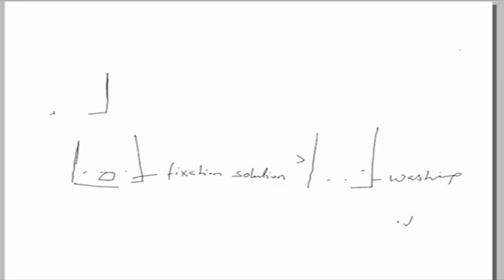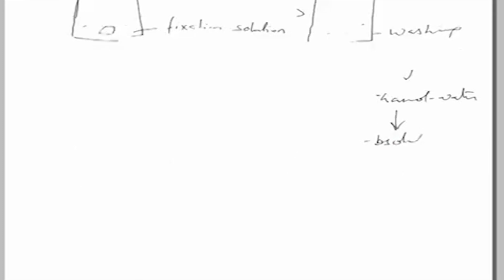So, a series of ethanol, water and finally the absolute ethanol will be utilized, and then propylene oxide will be utilized as a transition solvent.